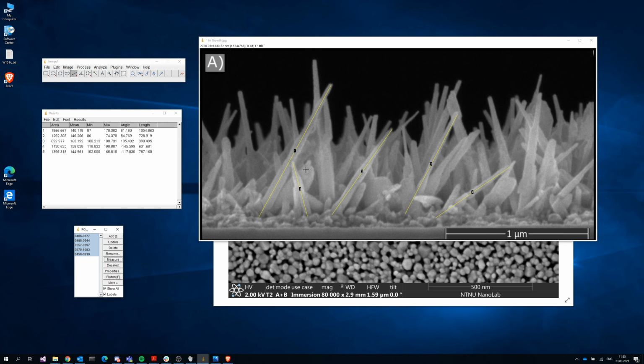We want to collect some data about the diameter too. So you'd probably want to do this again. Let's just clear this out. And again, come back here. Also, it's going to vary based on the person doing this. But as you can see with this one, this is very early growth. It's about 1 hour only. So perhaps the diameter is not uniform across as we stop mid-growth here.